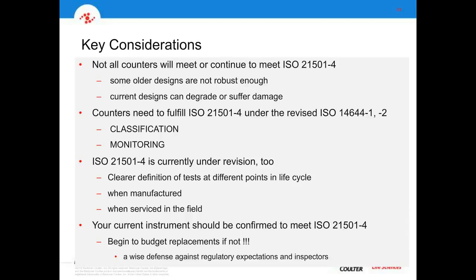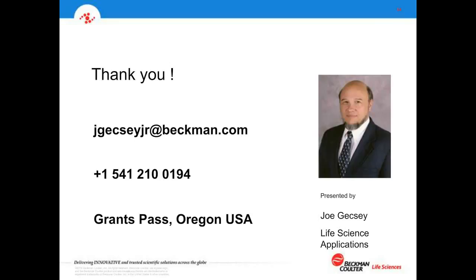So basically, the fundamental task for most people in looking at this requirement for 21501 is simply to confirm that your current instruments do meet the 21501, and if they don't, start the process of setting up replacements or getting to the point where you do meet the standard at a reasonable period of time within the next year or so.